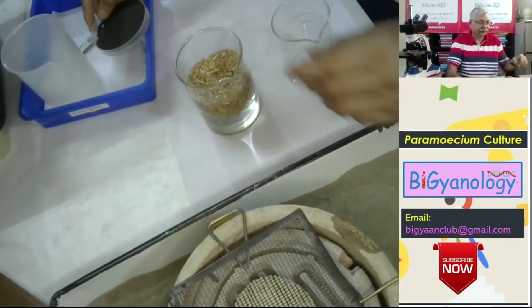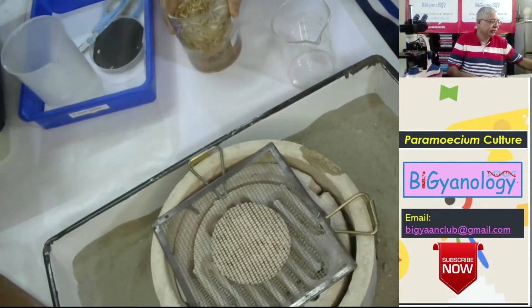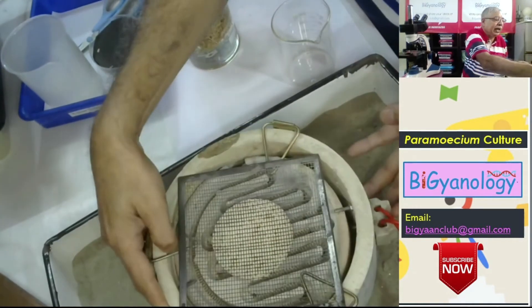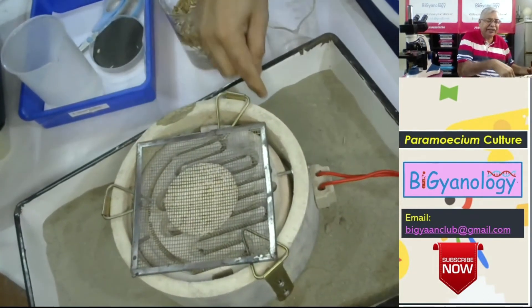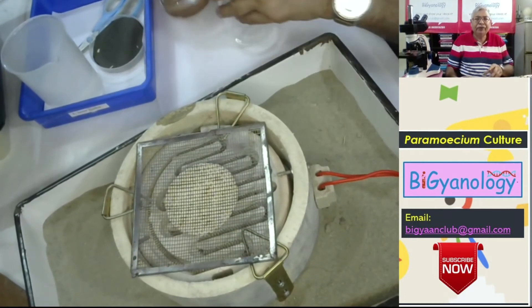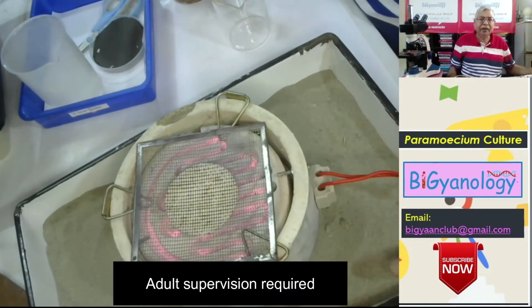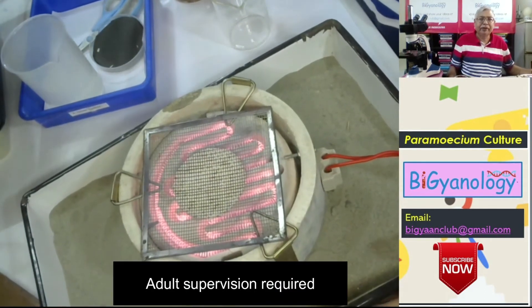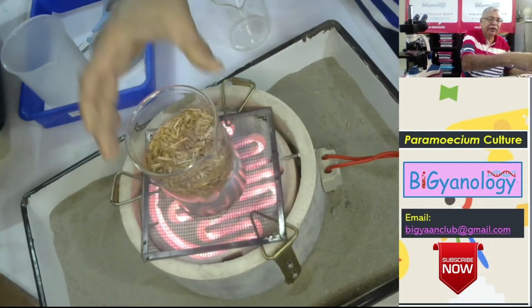Now let's switch on the heater which is here. Whenever you are using a heater, beware that it should be on a metallic surface — we have given it with sand. So when you switch on the heater, it takes some time and becomes red hot. When it is red hot, I am keeping this there so it will become heated.